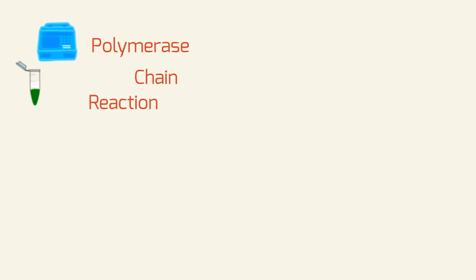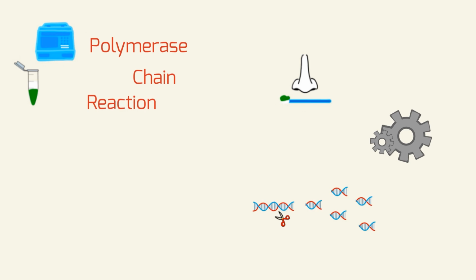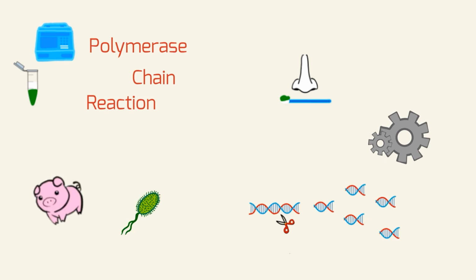However, PCR is not only of particular importance for diagnostic, but also for every step performed in genetic engineering. PCR offers the possibility to amplify and modify even small amounts of DNA sequences and therefore contribute to genetic modification of several organisms.